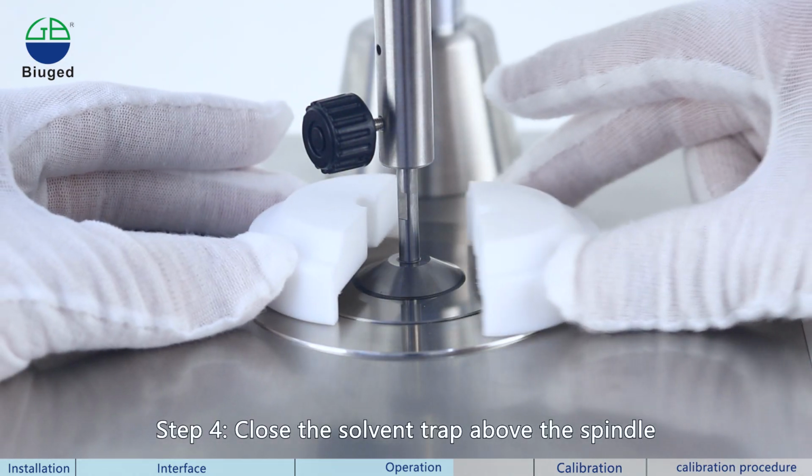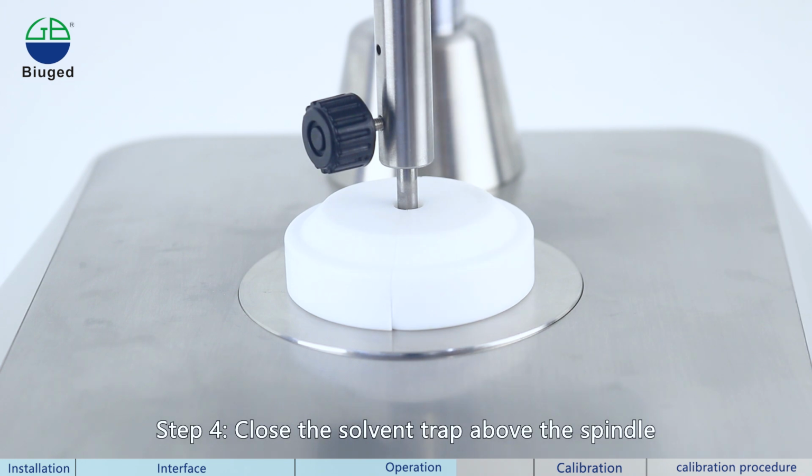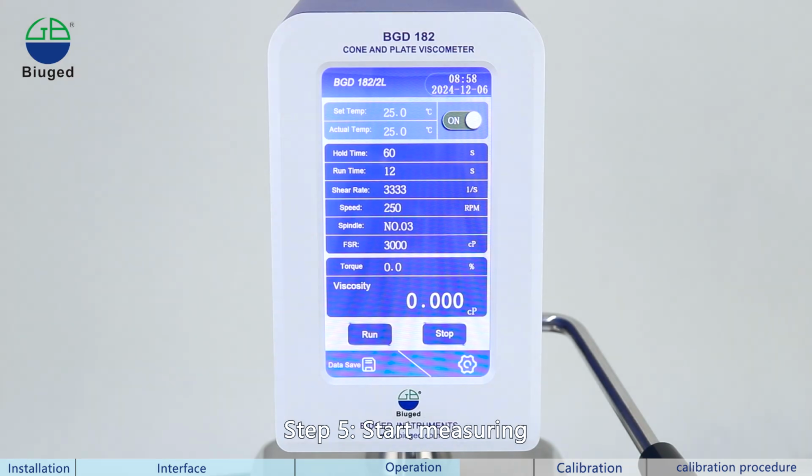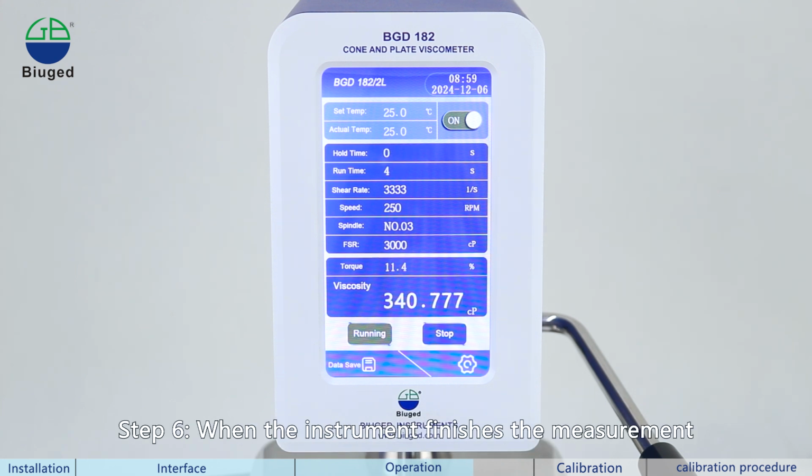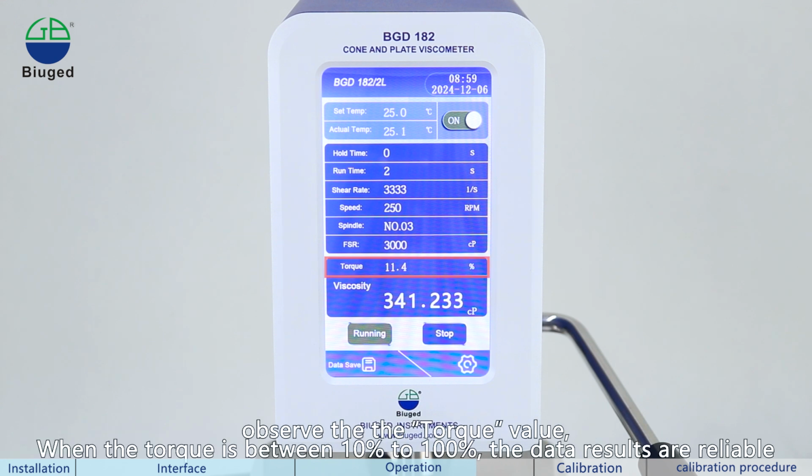Step 4. Close the solvent trap above the spindle. Step 5. Start measuring. Click Run and the instrument will automatically start measuring after the hold time. Step 6. When the instrument finishes the measurement, observe the torque value. When the torque is between 10% to 100%, the data results are reliable.